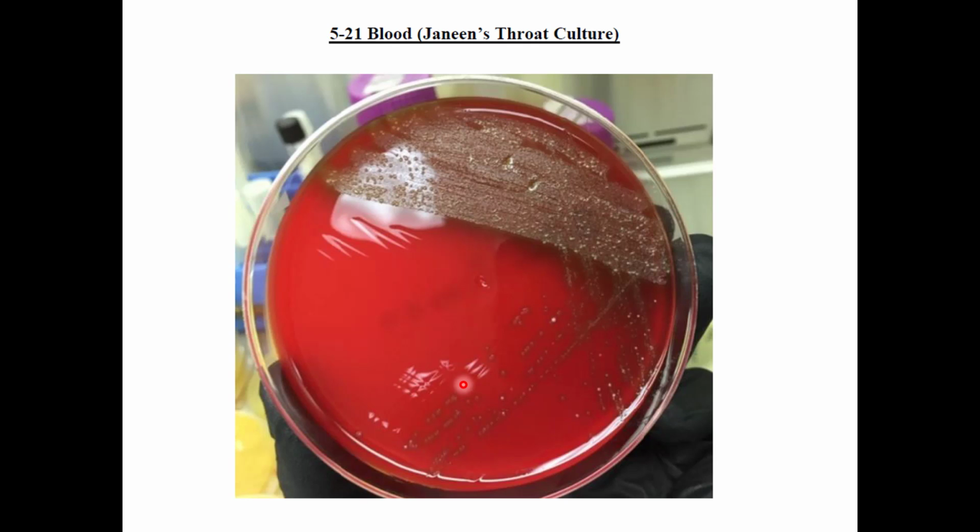Okay. So as you can see here, this is quadrant number 1, and then we got isolation as we move from 1 to 2 to 3, and we didn't get much in 4. You can see the marks of the streak in here, but we don't have any bacteria. But the only way to get isolation from a clinical sample, or any other sample that has a lot of microbes on it, is doing a 4-quadrant streak. So a streak line, a spot inoculation, wouldn't be appropriate for this. Even a zigzag wouldn't be appropriate at all. So we would try to find colonies.